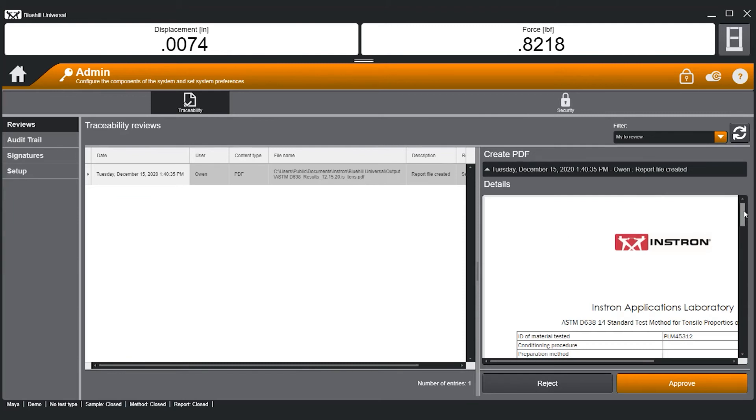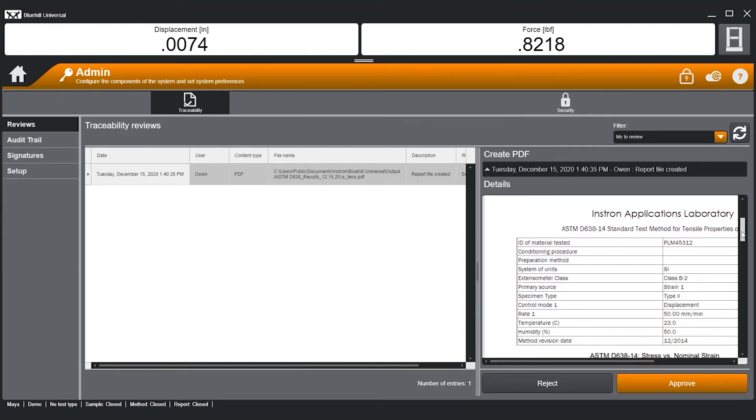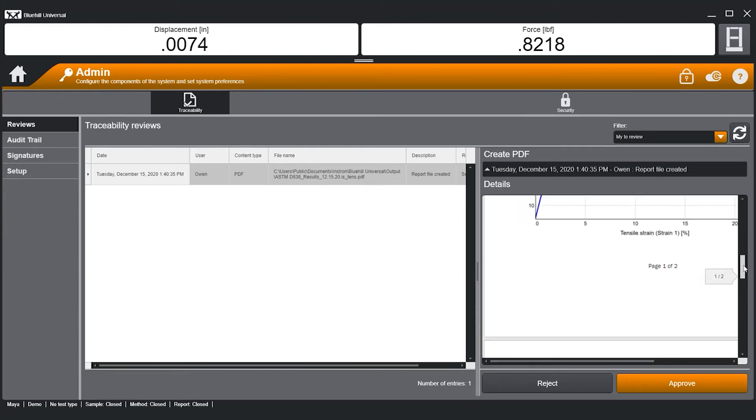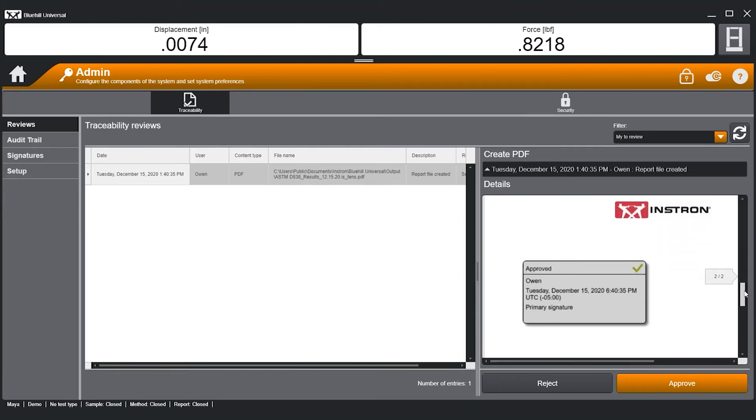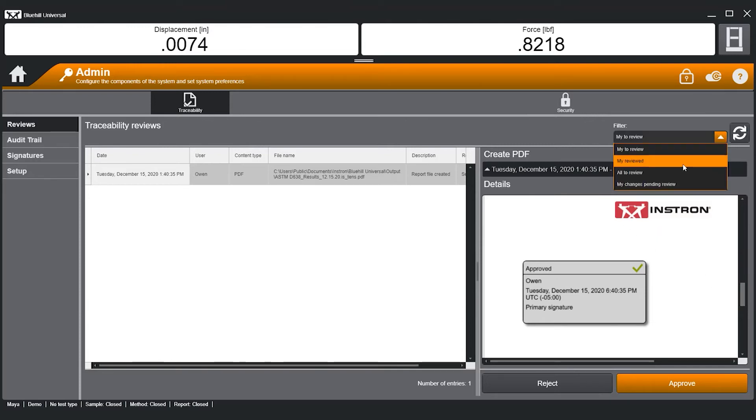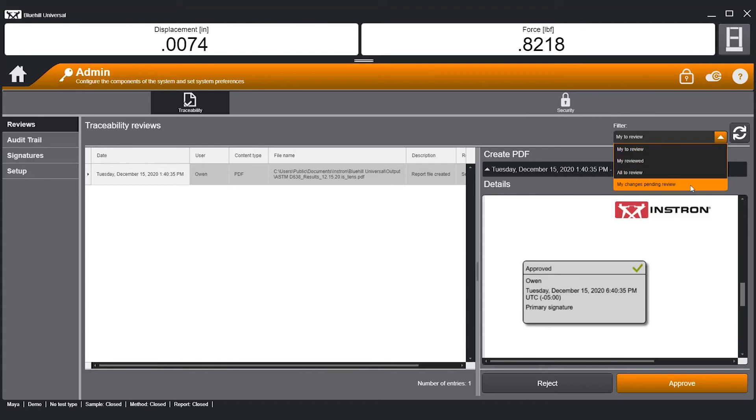PDF reports of test results are visible to assist the evaluation of data. Without secondary and tertiary signature permissions, users can view a list of their own pending changes.